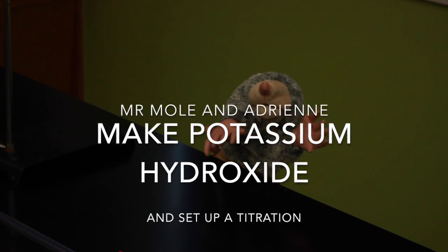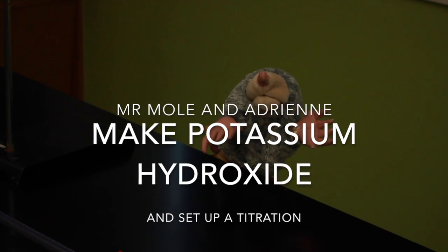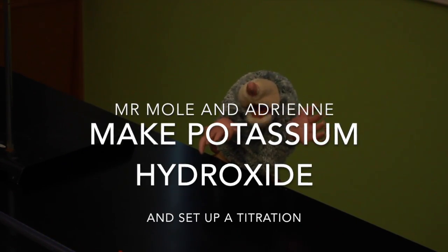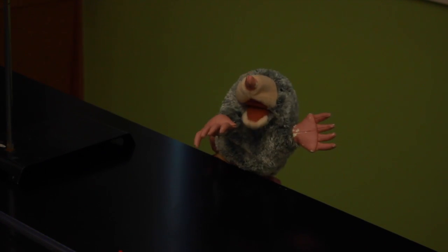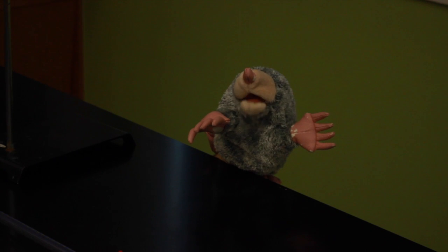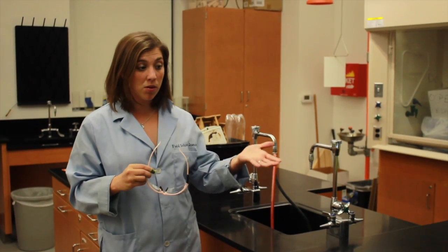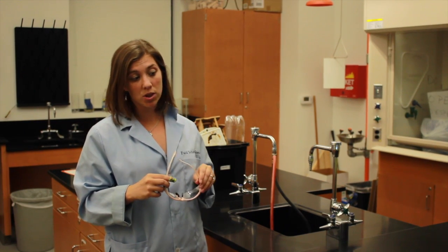Hello! As promised, we're now going to have a real live scientist show us how to make a 1 molar solution of potassium hydroxide. Okay, Mr. Mole, so you want a 1 molar solution of KOH.